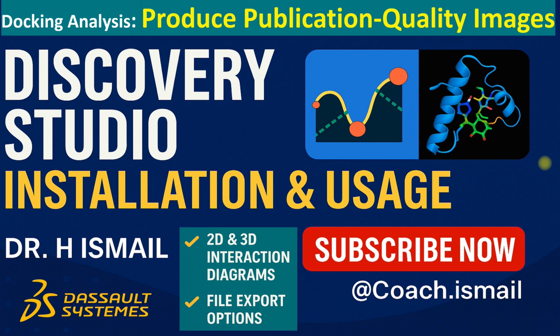The good thing about Discovery Studio is that it is free. You can download it from their official website and you can use it. In this tutorial, we will demonstrate how you can download, how you can install and how you can use Discovery Studio to produce publication quality images.